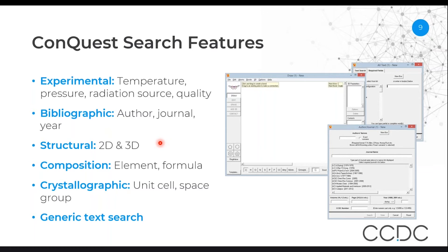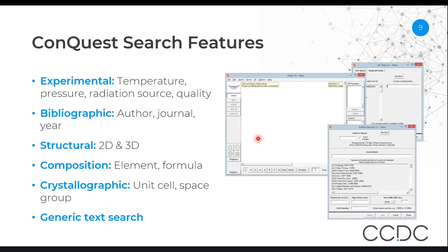It allows for structural searching, which includes a two-dimensional diagram search. This can be for a full structure or for a fragment. You can also include three-dimensional terms, so if you're looking for non-bonding interactions with specific parameters, you're able to define those quite easily with this interface.